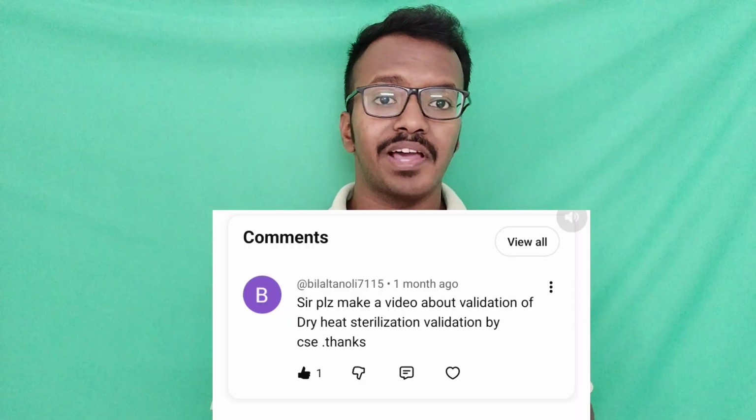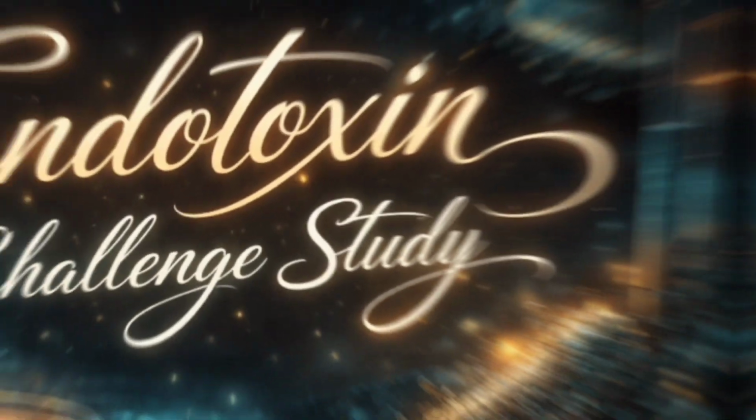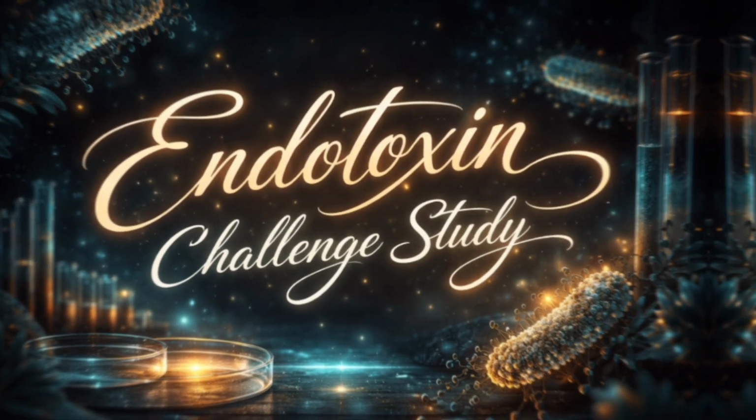Hi friends, when we started our YouTube channel, one viewer asked about endotoxin challenge study for tunnel validation. At the time, if we had discussed it directly, some viewers may not have understood the BET basic concept and fundamental key concept. For that reason, we discussed BET basic concepts in our previous videos. Today, we are going to discuss what the endotoxin challenge study for tunnel validation is.